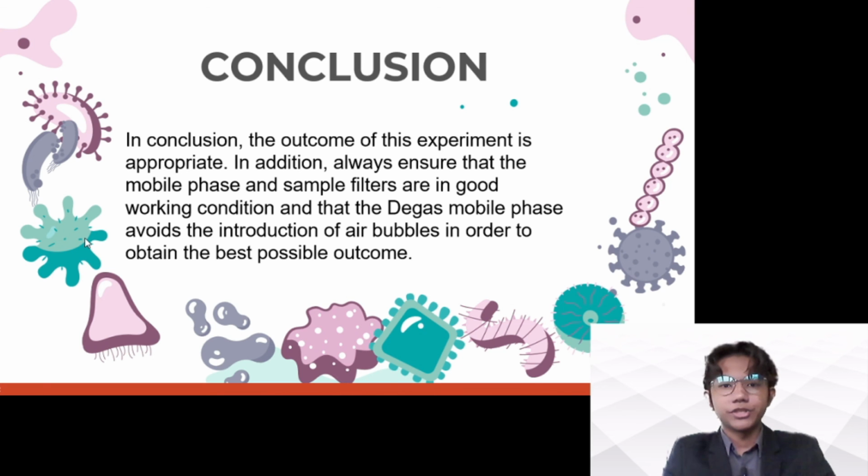In conclusion, the outcome of this experiment is appropriate. In addition, always ensure that the mobile phase and sample filter are in good working condition, and degas the mobile phase to avoid the introduction of air bubbles in order to obtain the best possible outcome.